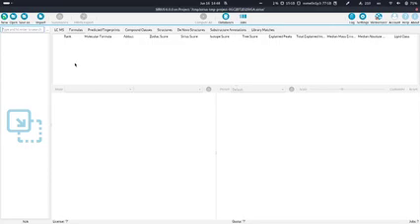But first, for all the people who don't know SIRIUS so well yet, this is how it looks if you don't have any data inside. So you don't have much to look at, but you have some buttons, for example, to open up a project space. If you have already done some computations and saved them, you can load them up with this open button. You can, of course, save your workspace.